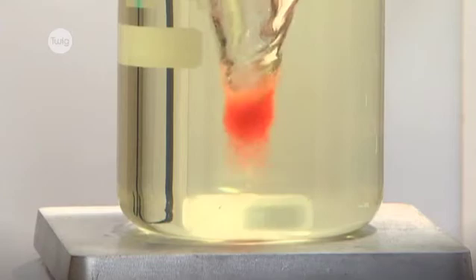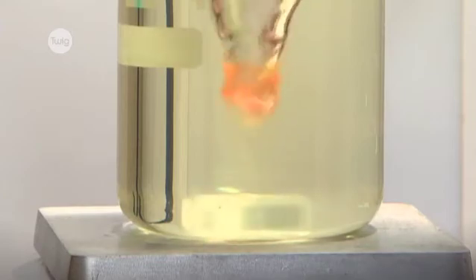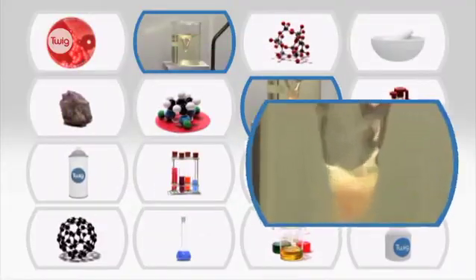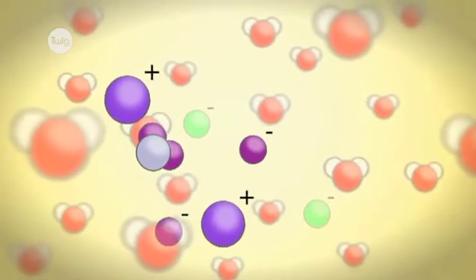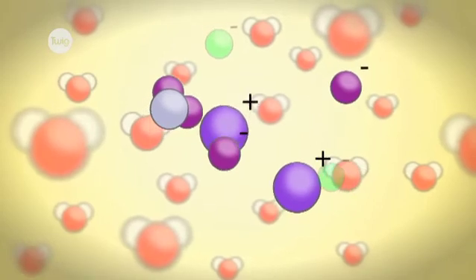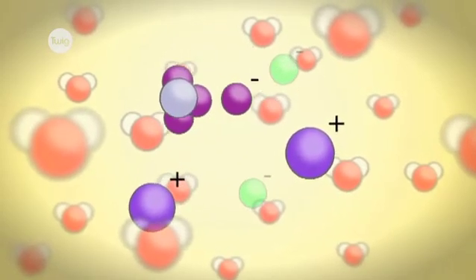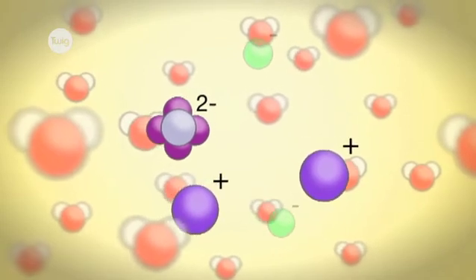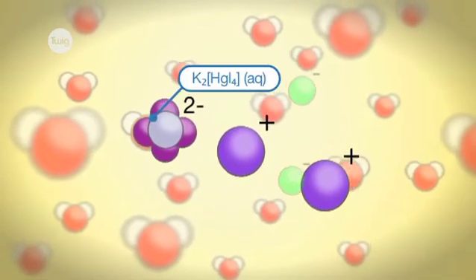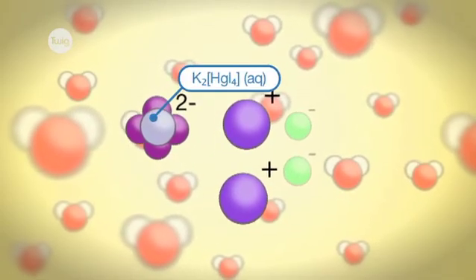We can see the mercury iodide forming as it precipitates out of solution. With potassium and iodide ions left in the solution, another reaction now occurs. These excess ions react with the mercury iodide precipitate to produce yet another compound: potassium tetraiodamercurate. This new compound is colourless and soluble, and so the orange tornado vanishes almost as soon as it forms.